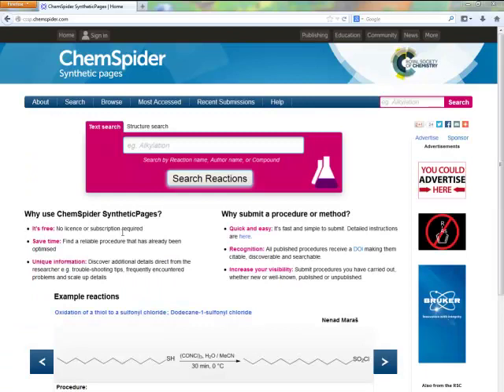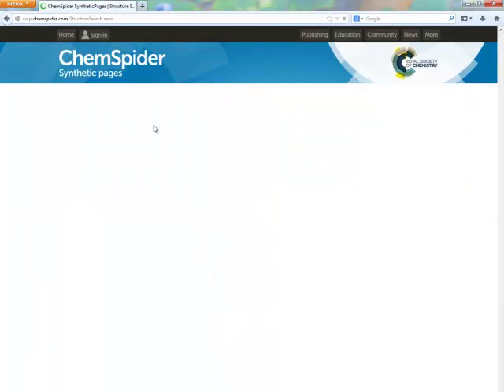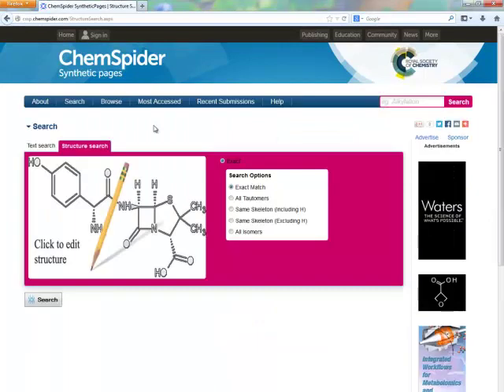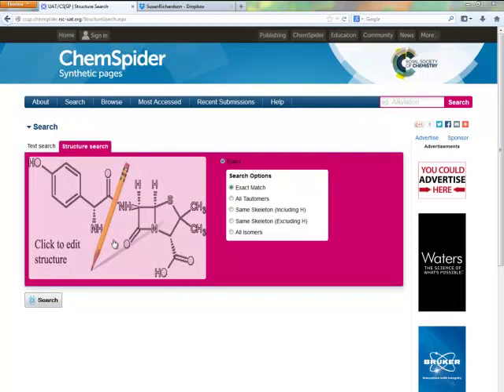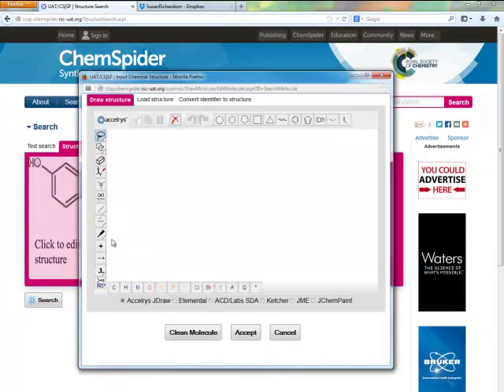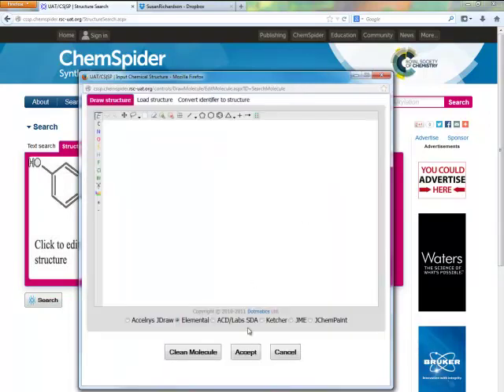You can start a structure search by clicking the structure search tab on the ChemSpider Synthetic Pages homepage, or by selecting structure search from the search menu. Then click to edit structure. A structure editor will open in a new window. We have several structure editors available, which can be selected by the radio buttons at the bottom of the page.